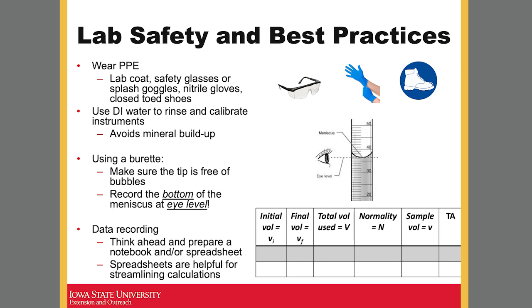That's always something we do in grape and wine chemistry, in a winery lab: keeping track of all your data, the date of your analysis, what samples you had, which grapes you collected, how you collected them, and whether you crushed a pool of grapes to evaluate if it's time to harvest, and where it was coming from.